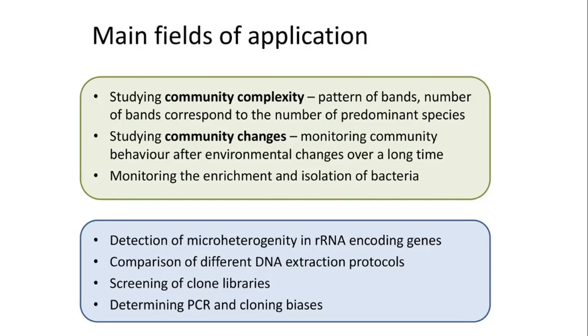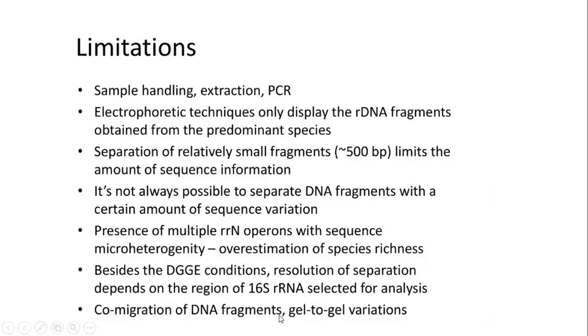We can also detect the microheterogeneity of the rRNA encoding genes, and the comparison of different DNA extraction protocols can also be made by the application of DGGE techniques. It is also used for the screening of clone libraries, and PCR and cloning biases can also be determined by the DGGE technique.